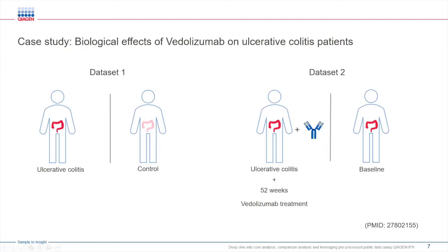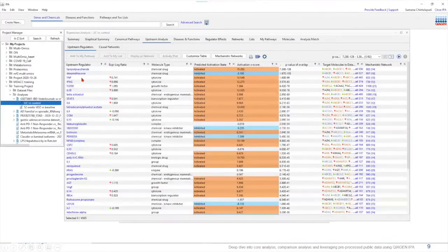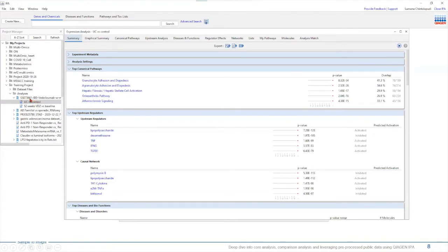When you open IPA on the left hand side we have our project manager window. This is the place where you'll find any of your data set that you have uploaded and analyzed. Once you double click on your analysis, here in this case we have ulcerative colitis versus control data, this will open up the core analysis results for us.